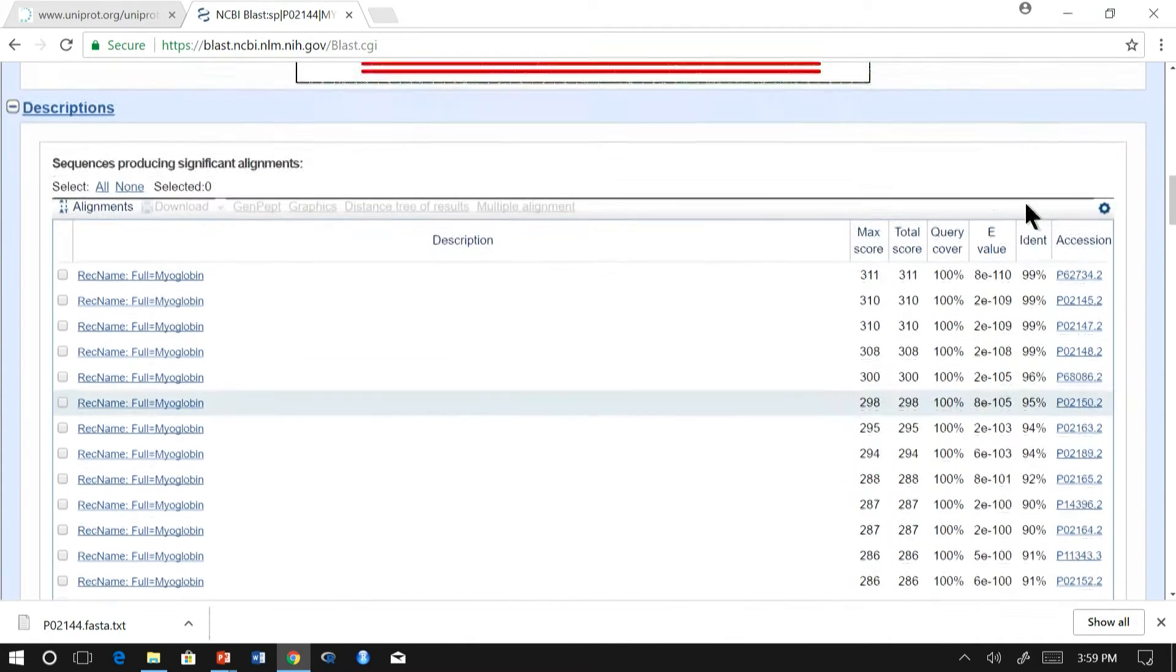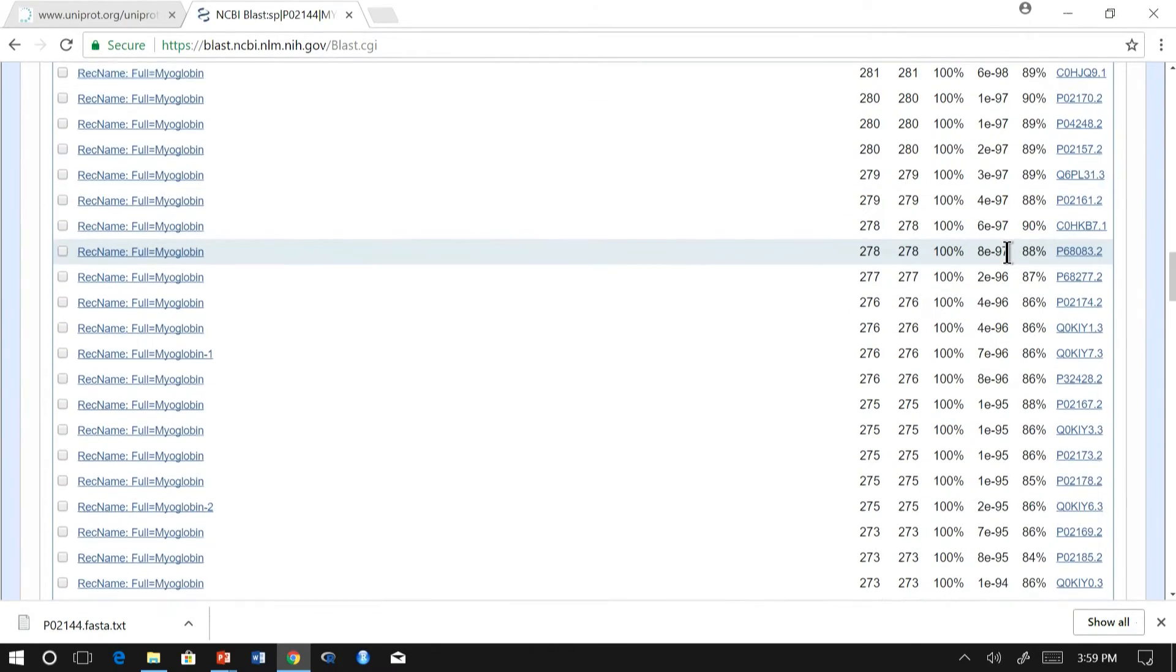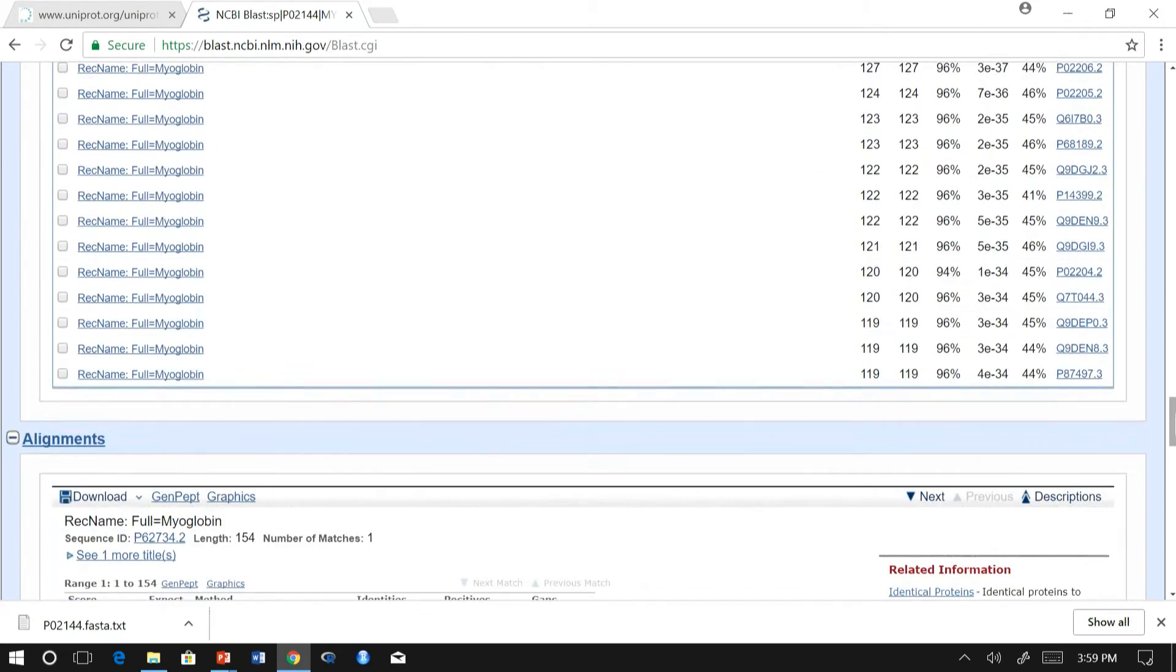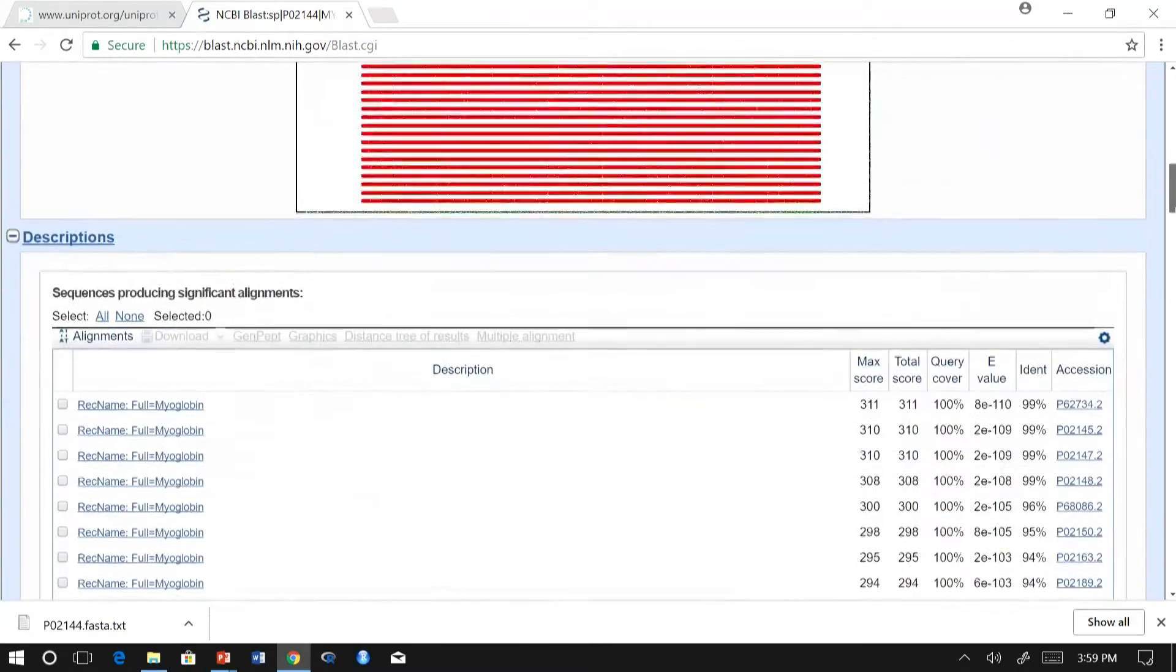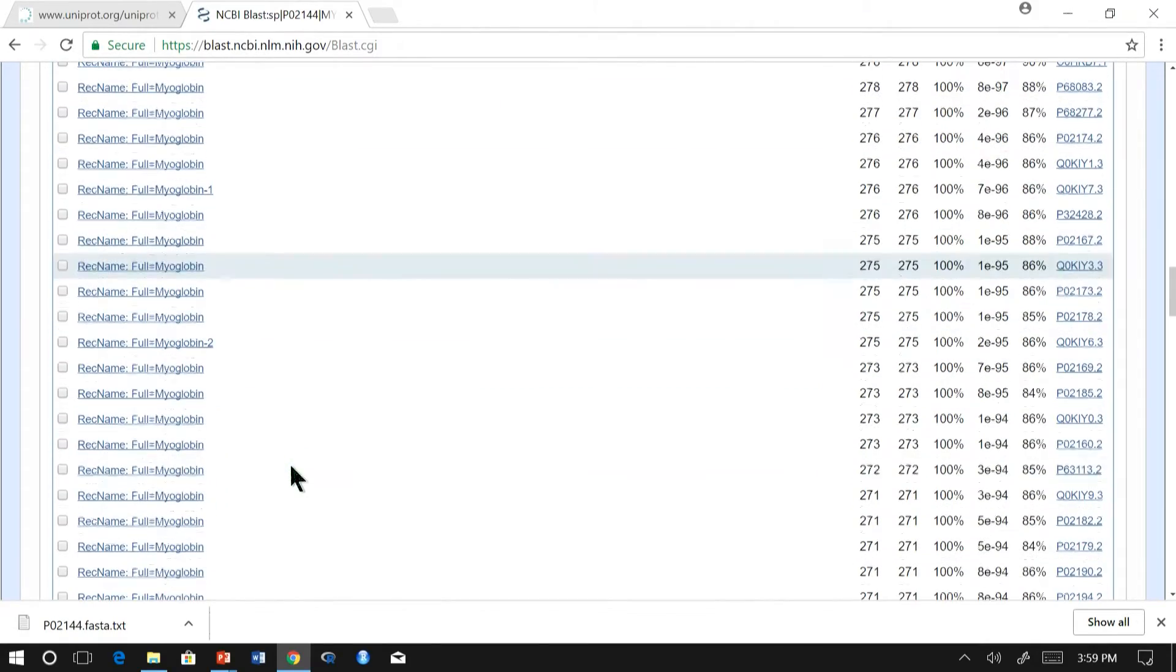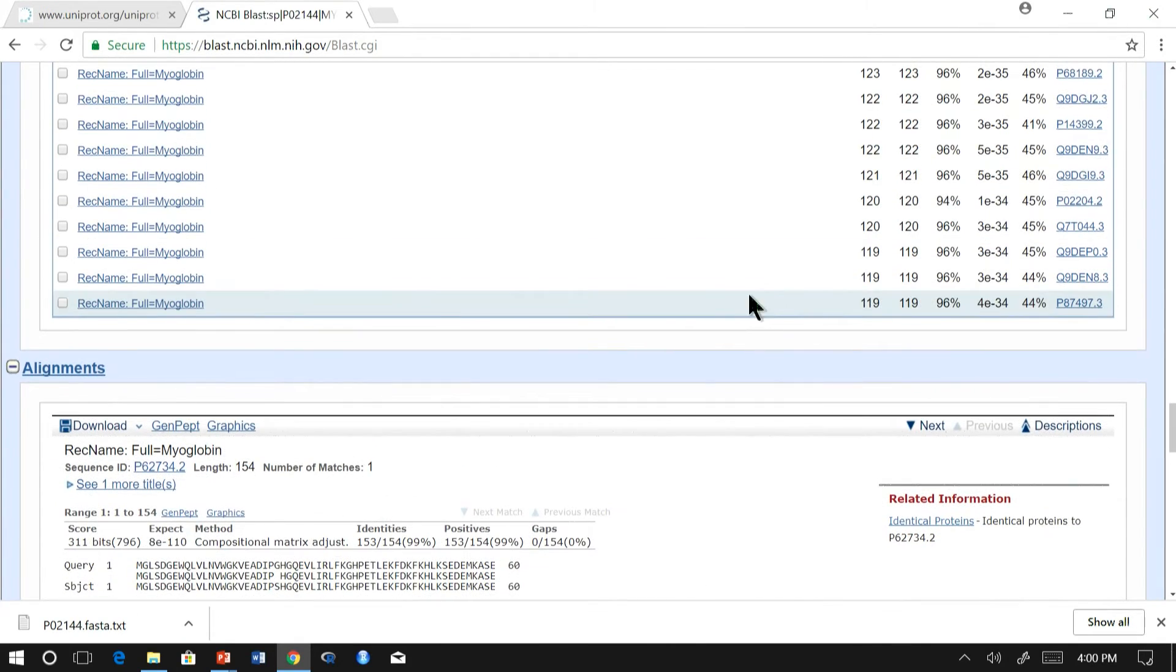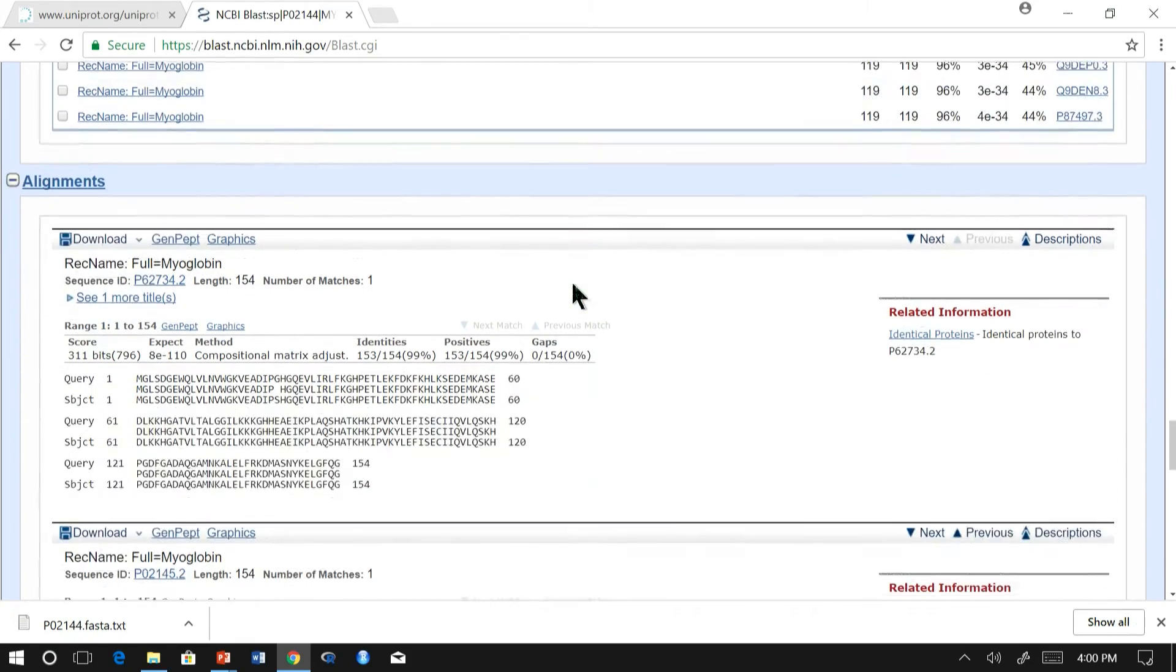As you could see, the identity keeps on decreasing with the E value increasing. And most of these blasted results are from myoglobin from other organisms, which differs from the human myoglobin. And if you extend, you would also see hemoglobin, which is very similar to myoglobin.